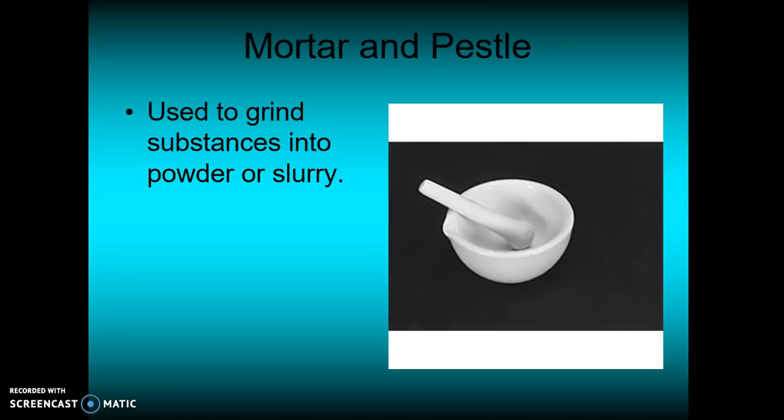Mortar and pestle, these are used to grind substances into powder. There will be a lab in which you'll be using these to crush some of the tablets. They're used to grind the substance into powder and smaller particles.